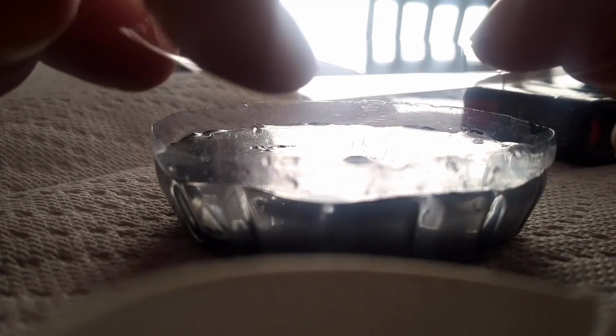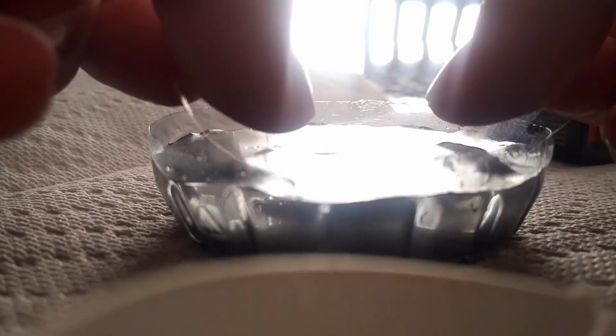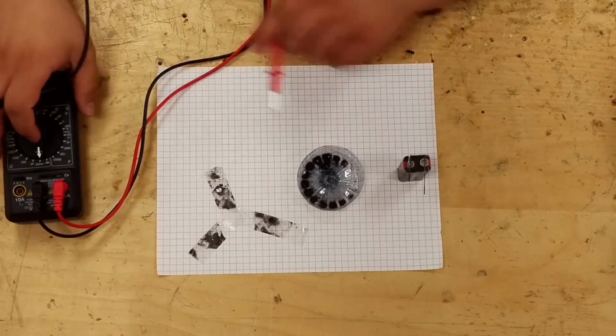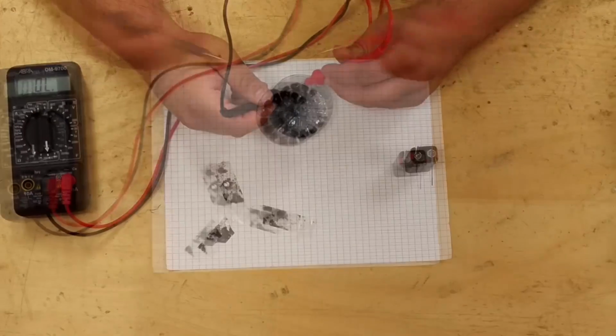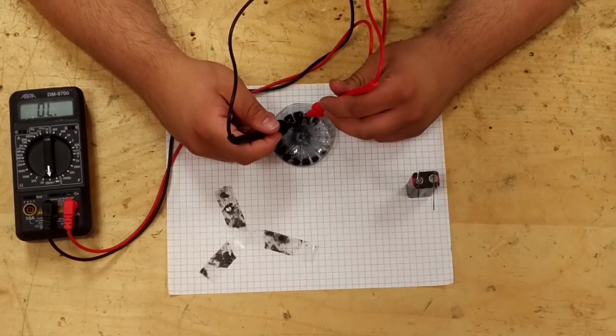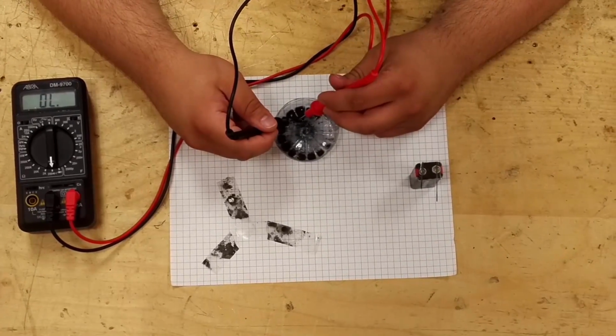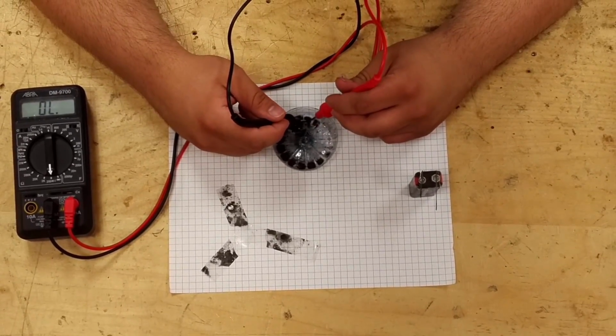So we're just going to skim the little flakes of graphene off the surface using tape. Oop, one little bubble came along with that one. That's interesting. Okay, so this is all of our yield. Now I'm going to go through it and test each little piece of graphene, hoping that we get a proper connection.